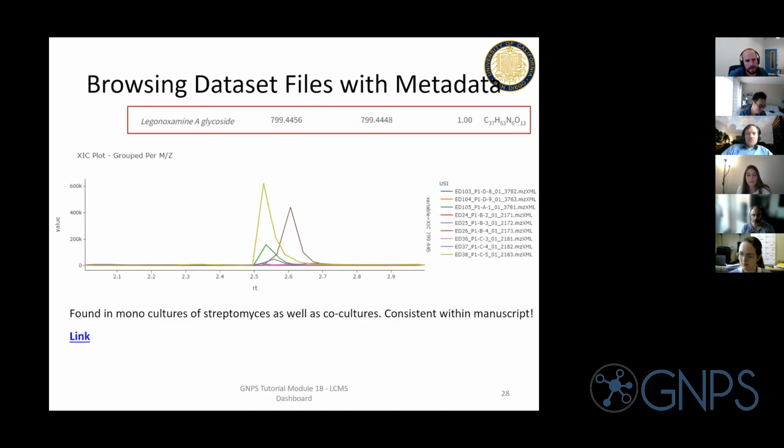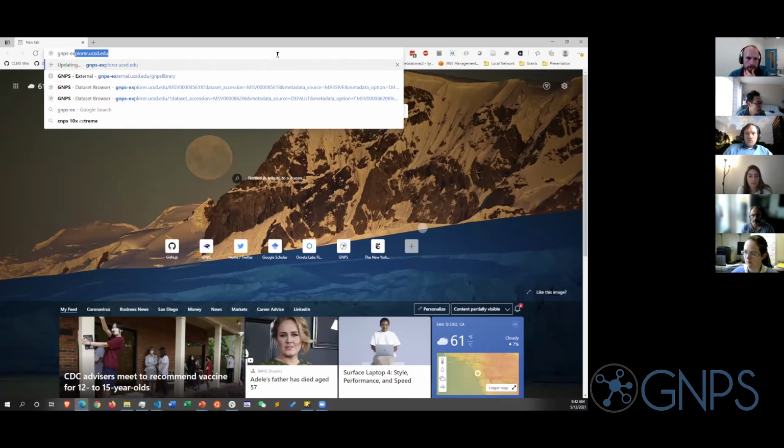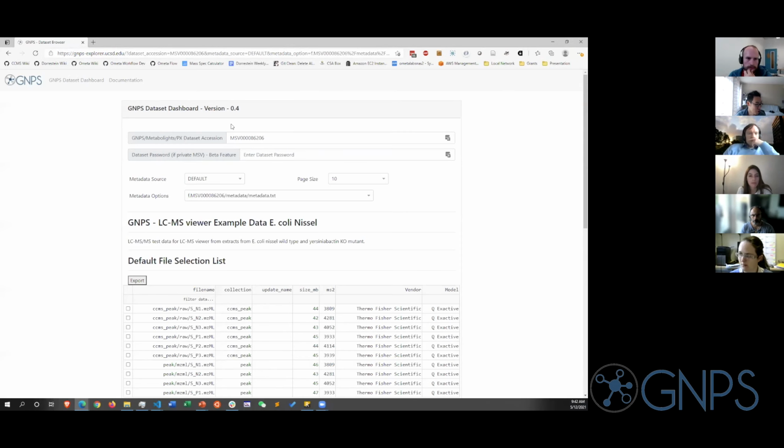Okay. Anyway, maybe just reiterate really quick what different repositories feed into the dashboard. Yes, that's a great point. So the very first one, maybe I'll just show it off interactively so that you guys can get an idea of where you can select data.